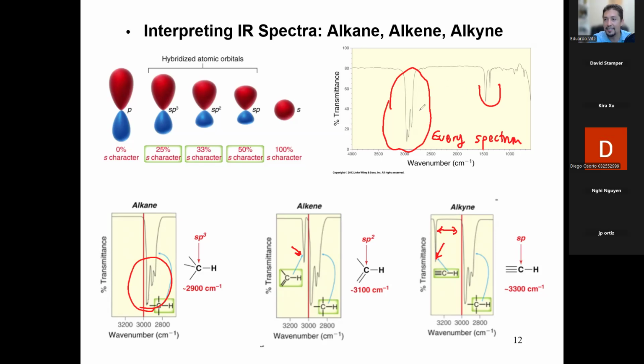Since I see the stalagmites and nothing else, it has to be only a hydrogen carbon compound. There are no other functional groups in it. So in IR, we are selective with what peaks and what regions we're looking at. We don't analyze the whole spectra. We only look at certain parts of the spectra to give us the information that we need. So any questions about alkanes, alkenes, alkynes?